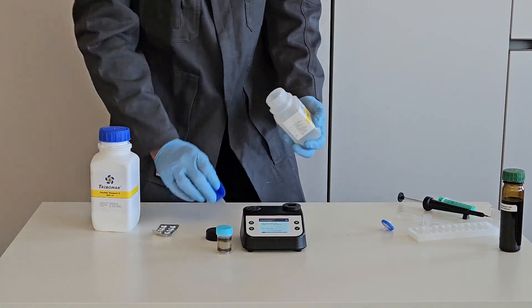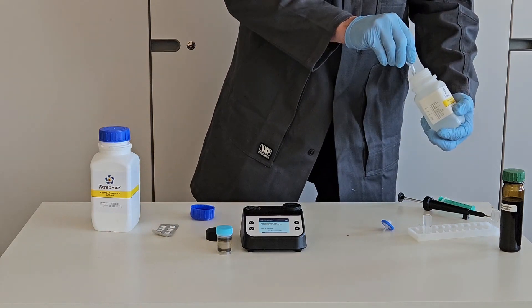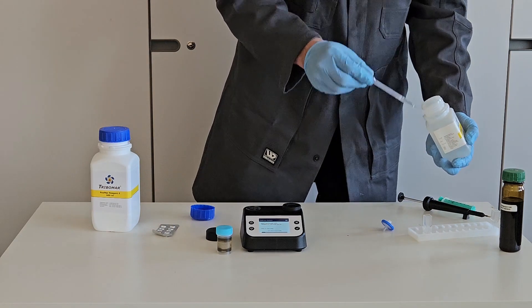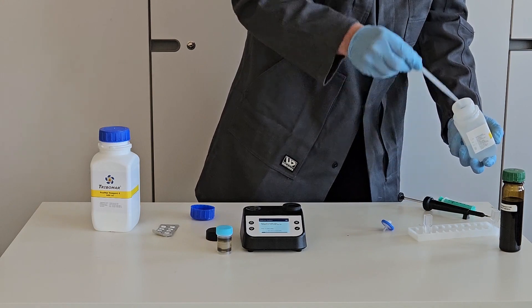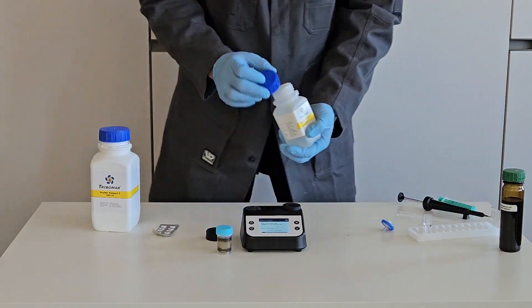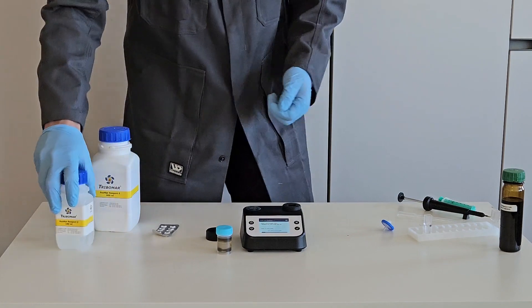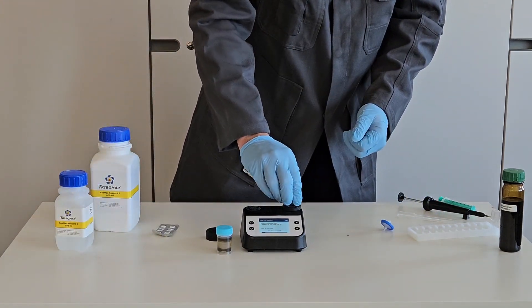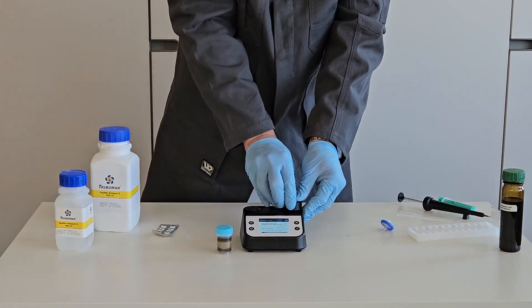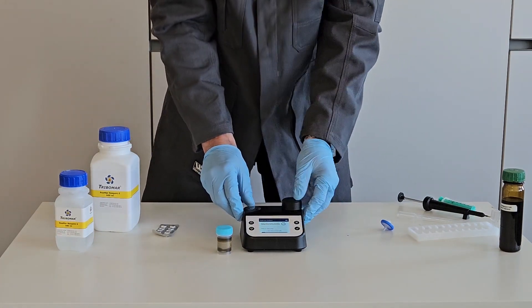Starting with the self calibration. Fill a cuvette with 2 ml reagent S. Put the cuvette into the holder and close the lid. This needs to be done only at the start once.